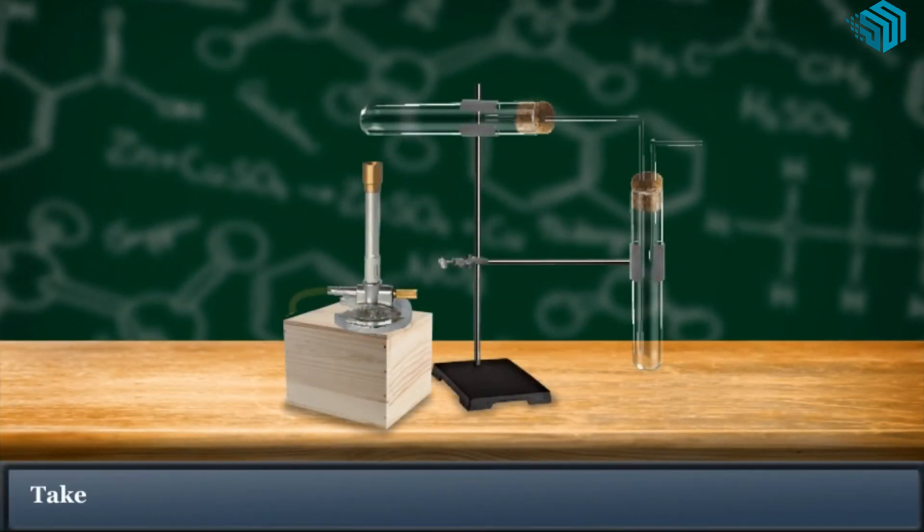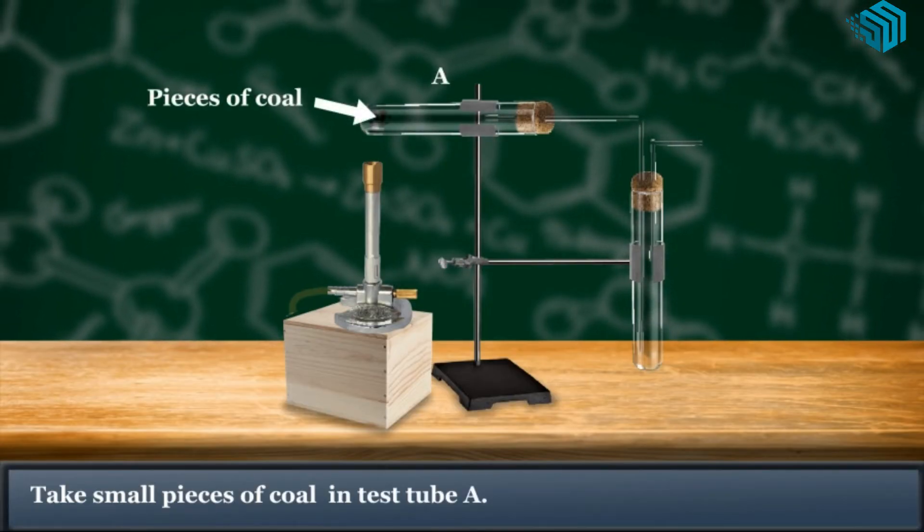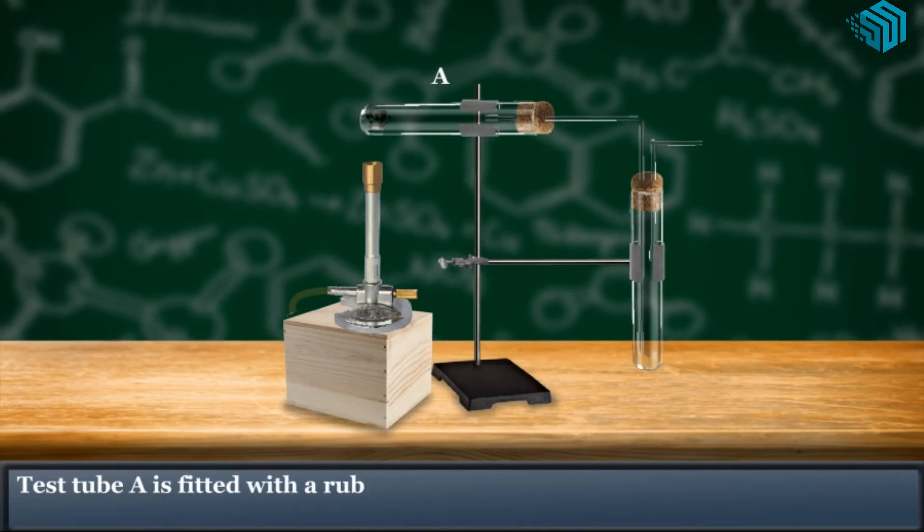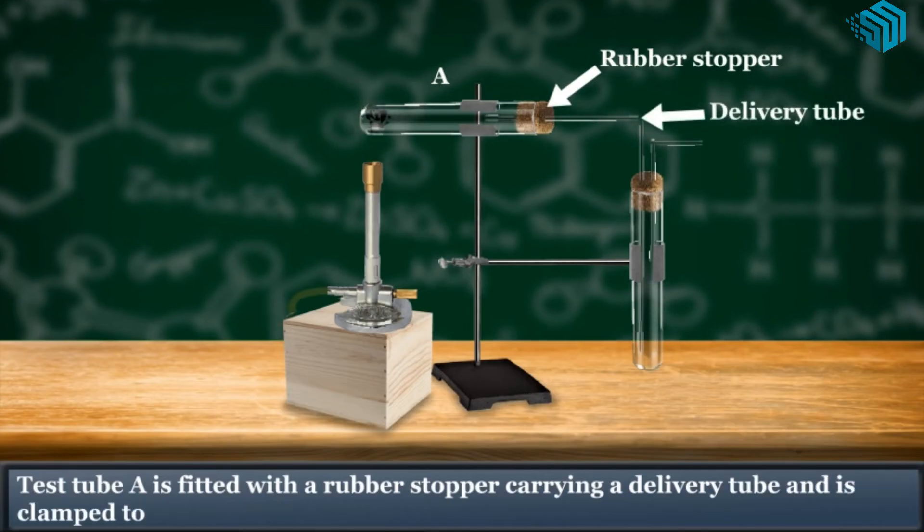The Procedure: Take small pieces of coal in test tube A. Test tube A is fitted with a rubber stopper carrying a delivery tube and is clamped to the stand.